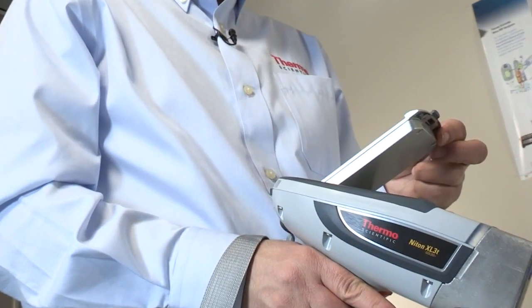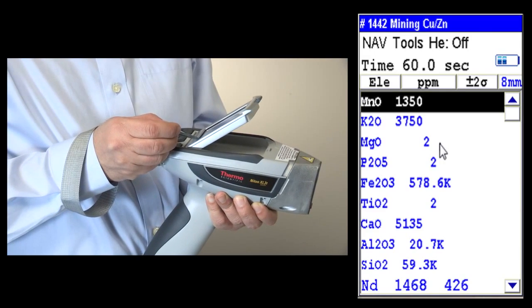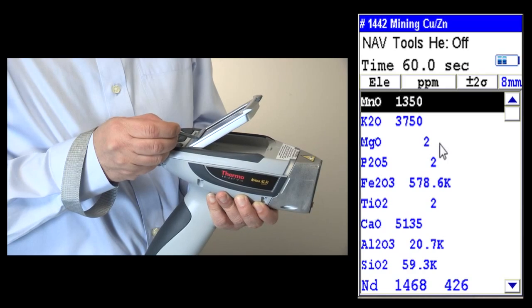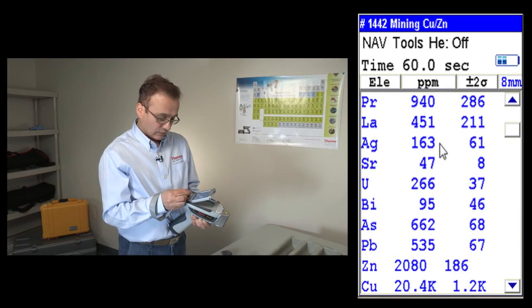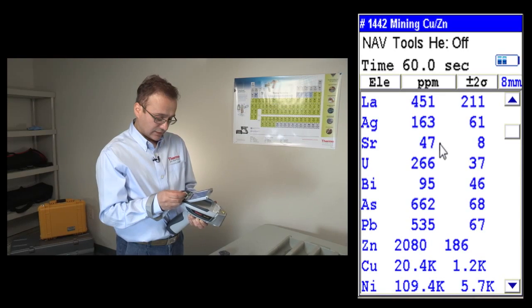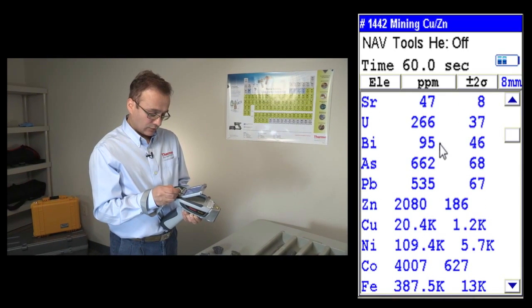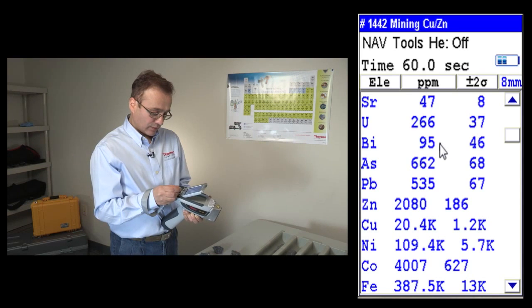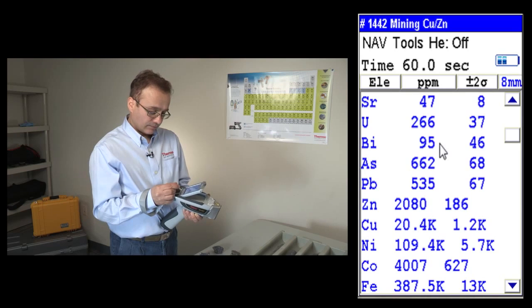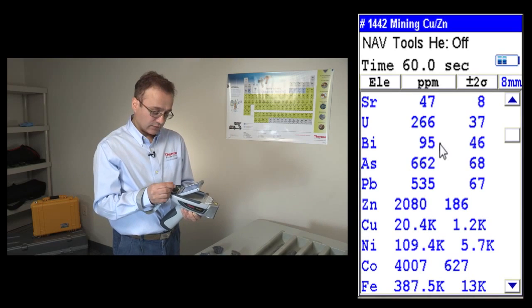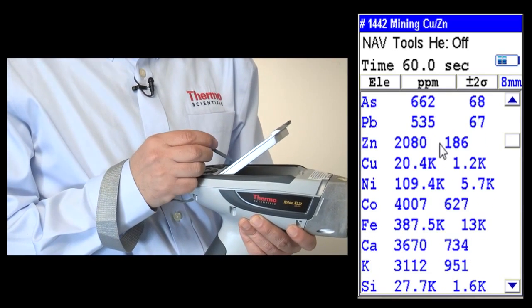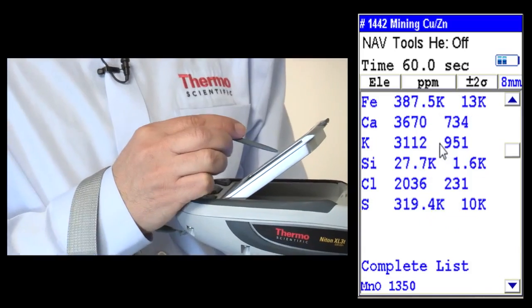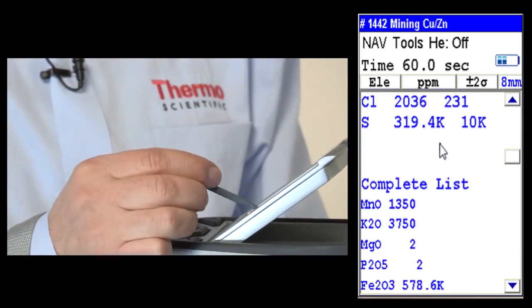I can see the oxides first from manganese oxide to silicon oxide, neodymium, some rare earth elements, silver, strontium, uranium. This sample has lots of nickel, almost 11% nickel because the sample is nickel sulfide. Copper, you can see the whole list that we analyzed just in 60 seconds.